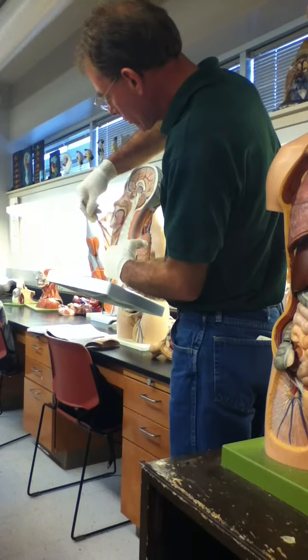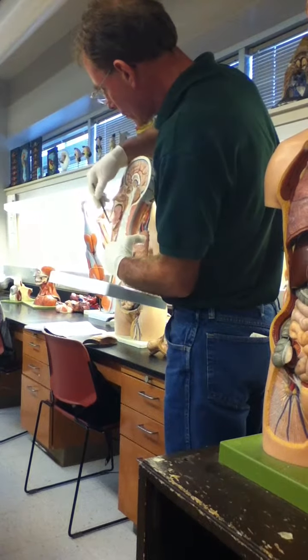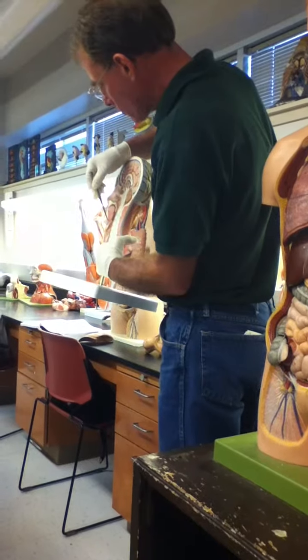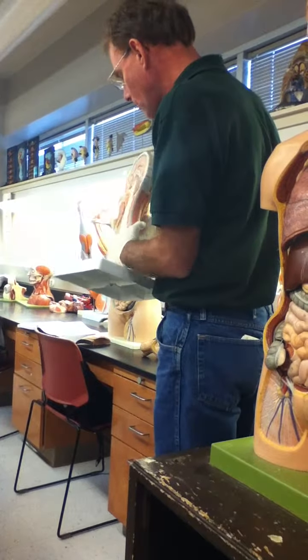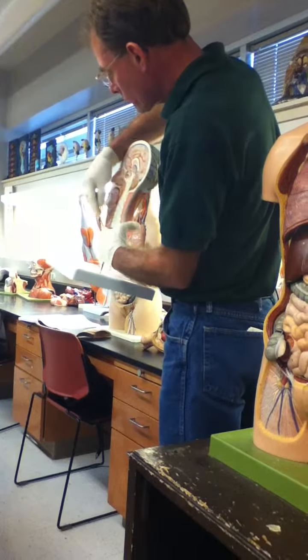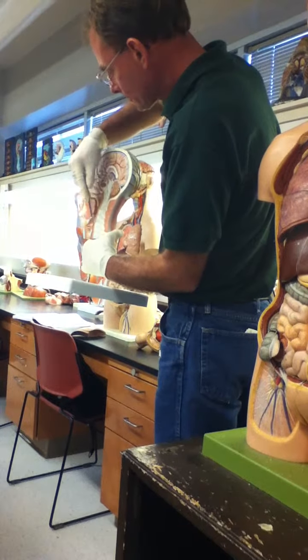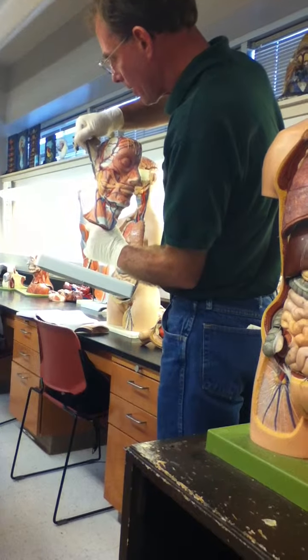This structure here, this whole structure is your larynx. And inside your larynx, you'll find your vocal cords. And above it, you'll find your epiglottis, which is here, which is cartilage, and that's cartilage too. Later on, you're going to learn different tissue types, so that's cartilage. Might as well see it, recognize it. Your larynx would be down, or your trachea would be down here. And then here's your esophagus. And then your parotid salivary glands are right there.